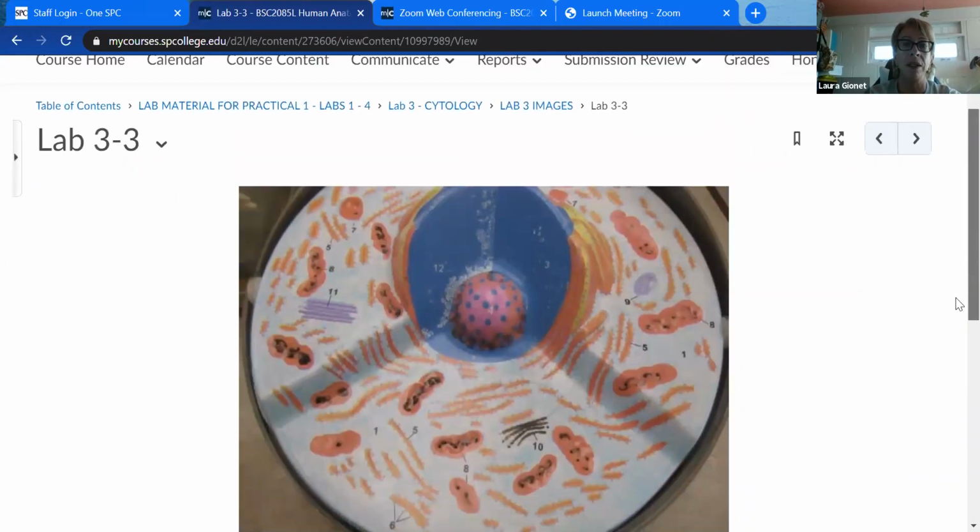Okay, so here we can see some of these. Essentially, the cytosol, here's your number 1, is the light blue watery background. Number 5 here is a rough endoplasmic reticulum, but so are these and so are these. Here's that number 6 I was talking to you about. You have some lines drawn from the ribosomes on the surface of an RER, and therefore that's number 6. Here's number 7, a nice little brown stack of sacs for the Golgi apparatus.